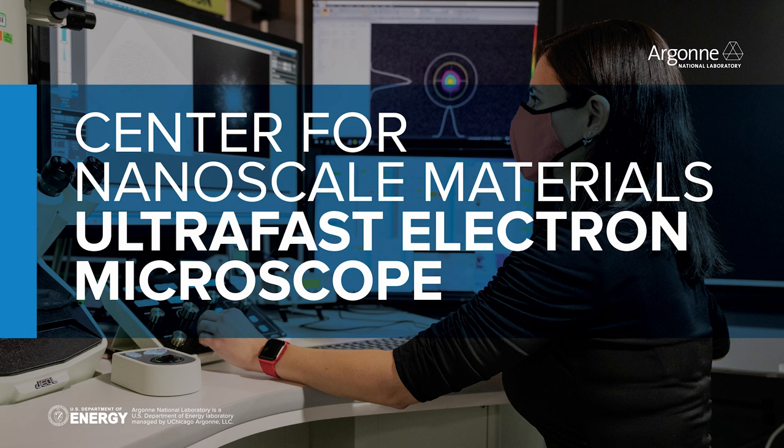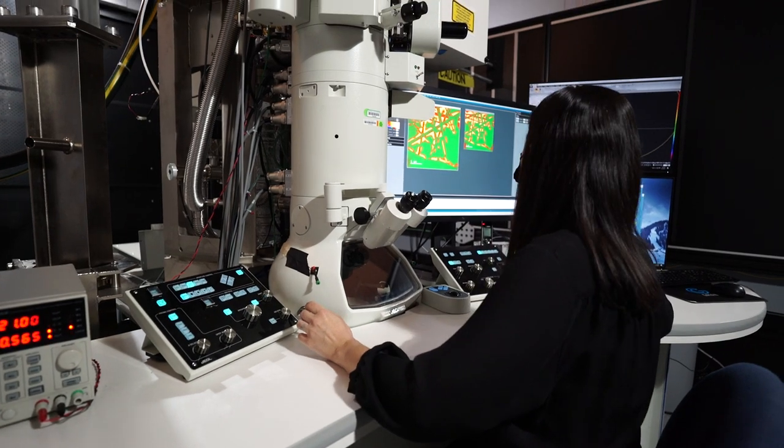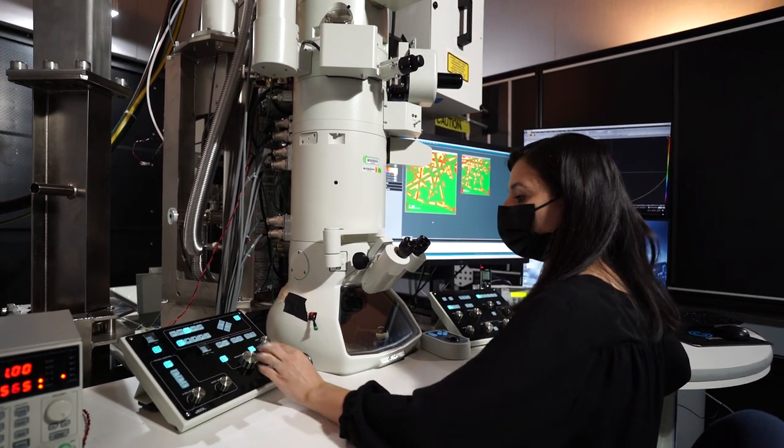The ultrafast electron microscope brings together two separate techniques, both of which are very complex in their own right. One of them is ultrafast laser spectroscopy and the other is transmission electron microscopy.